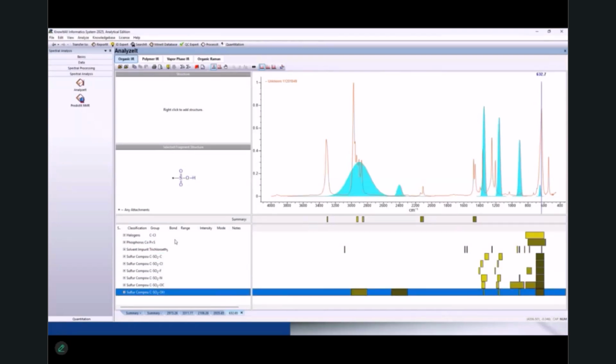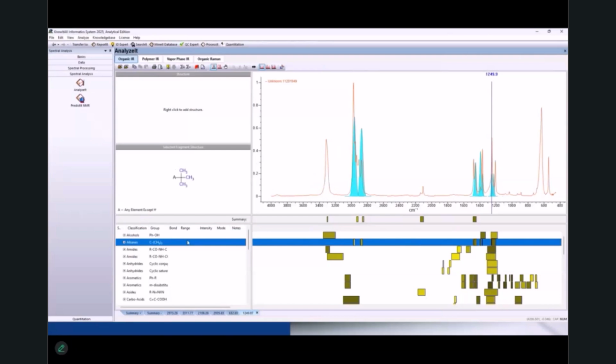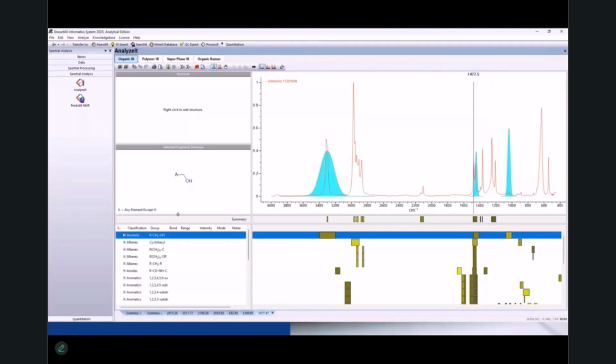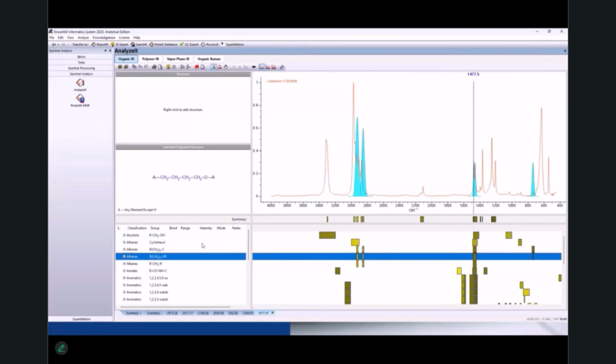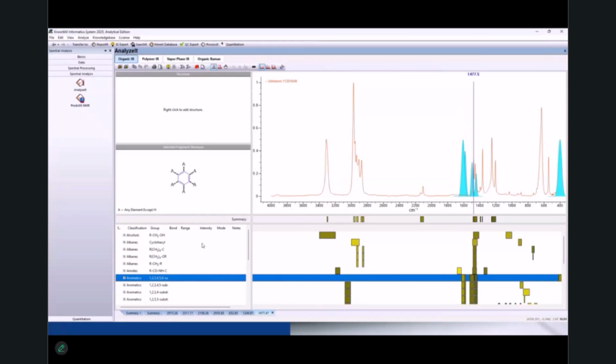These ones don't really seem aligned. And I'll keep moving. This one looks pretty good, so I'll add it to the summary as well. And I will do one more. These ones are all, I already added some of these.